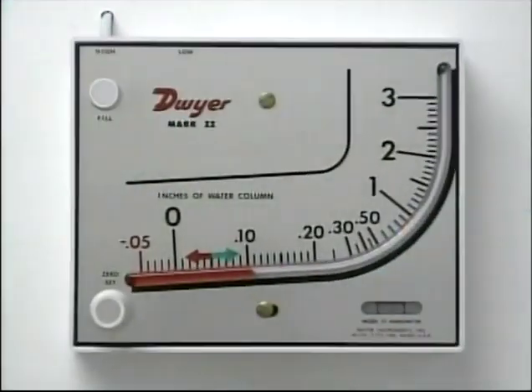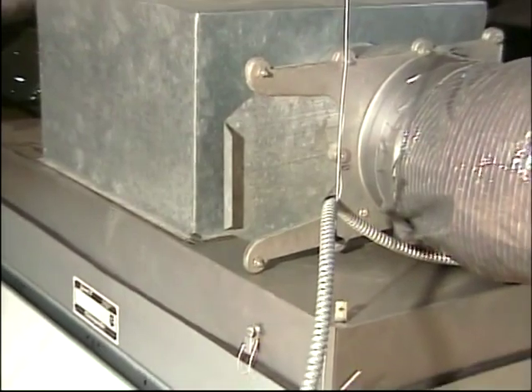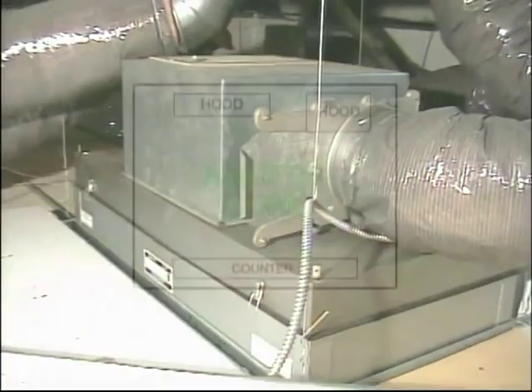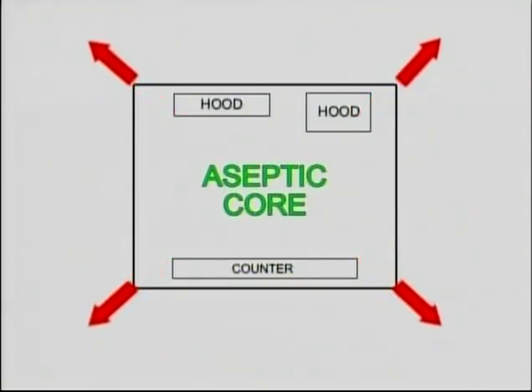Ideally, the buffer zone will be supplied with HEPA-filtered air through supply terminals with sufficient volume to meet design cleanliness requirements under operational conditions. The buffer zone should be under positive flow or pressure to the gowning anteroom, which is in turn under positive flow or pressure to the outside environment. The buffer zone may have its own HEPA-filtered air supply. This arrangement causes facility air to flow outward from cleaner to dirtier areas, preventing the ingress of atmospheric contamination.